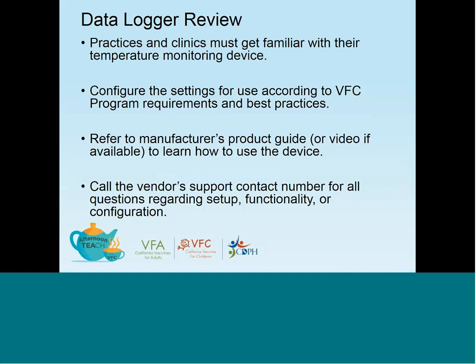Make sure you configure the settings for use according to VFC program requirements and best practices. When necessary, refer to the manufacturer's product guide to learn how to use the device. And we found that there are many helpful videos on YouTube. If questions arise, call the vendor support contact number for all questions regarding setup, functionality, or configuration.